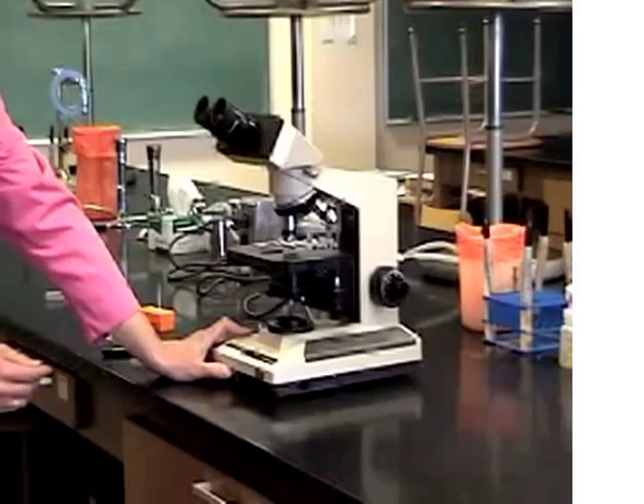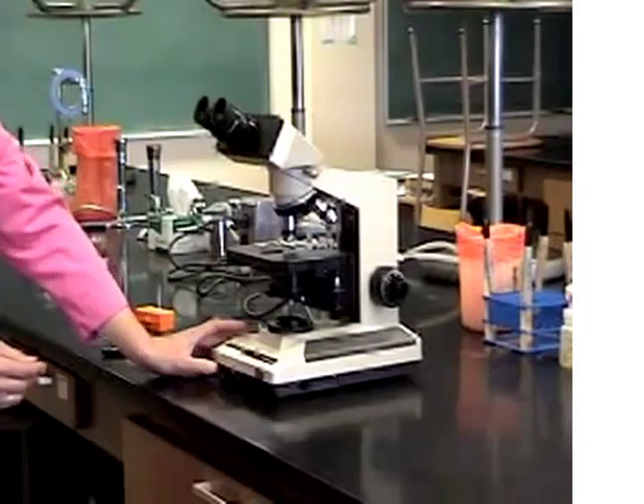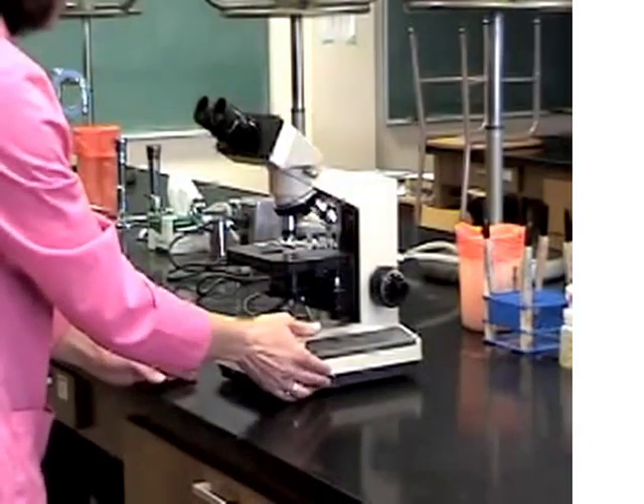Now turn your microscope on. The power switch is on the bottom left and the light intensity can be adjusted on the bottom right.